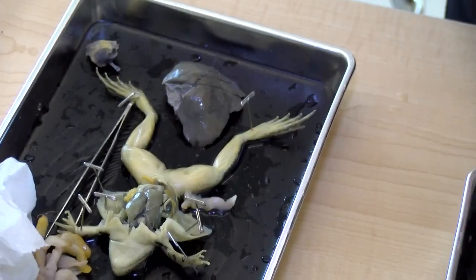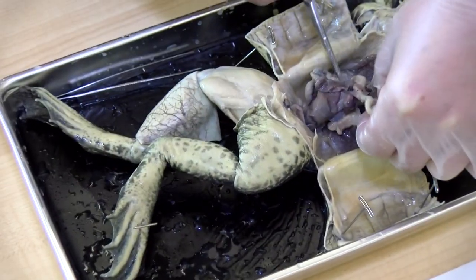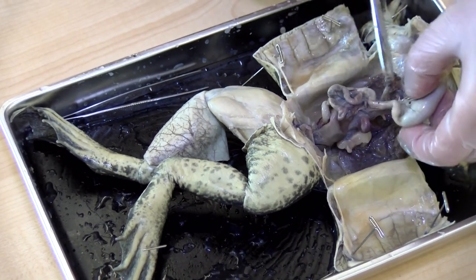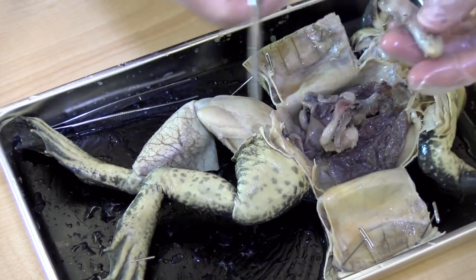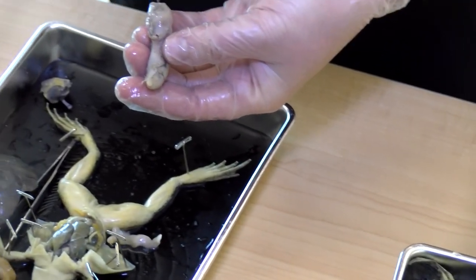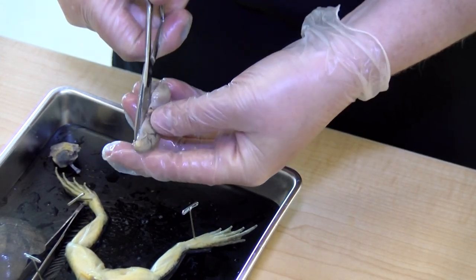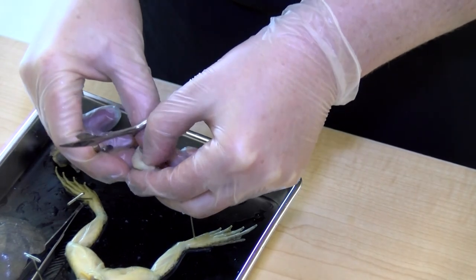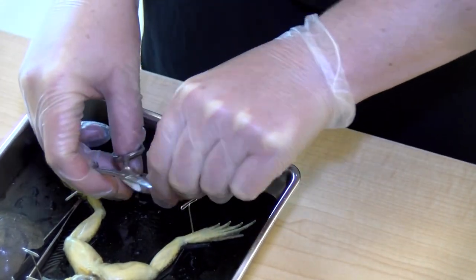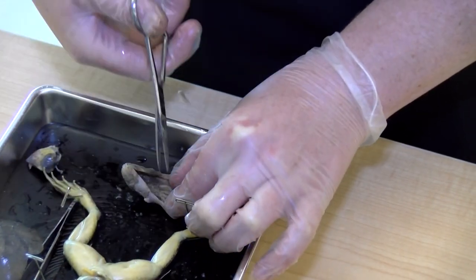We've got our stomach connection here. I'm going to open up the stomach and see if we can smell what it's been eating. What's in there, Miss Muirhead? Some decomposed, digested things.